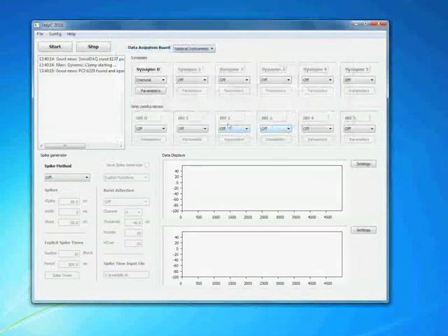To now actually simulate an electrical component in the cell, we need to configure which components to simulate and which parameters to use. And I'll show the example here for chemical synapse. So I've already chosen here chemical synapse.